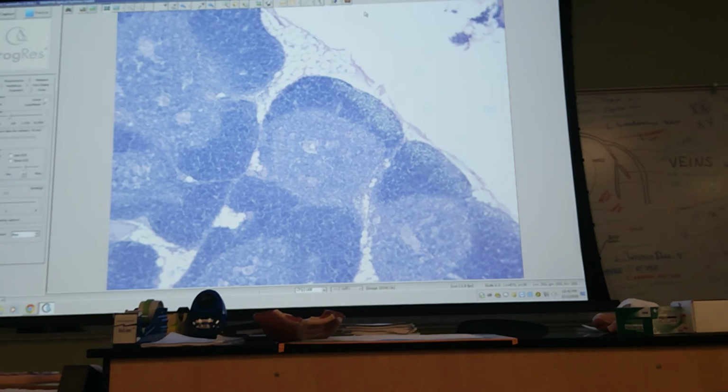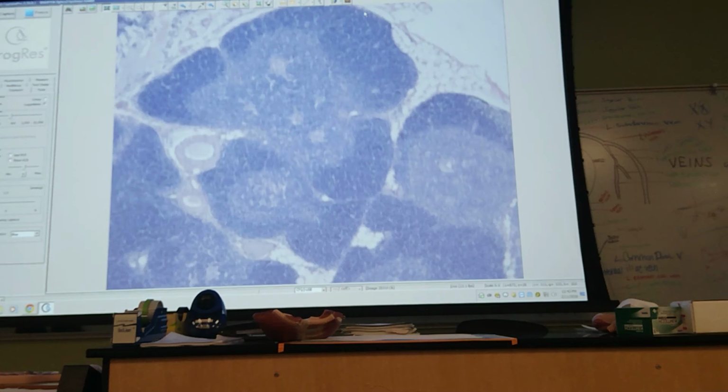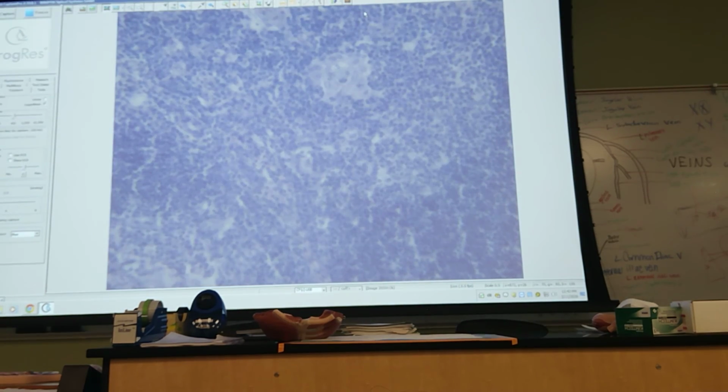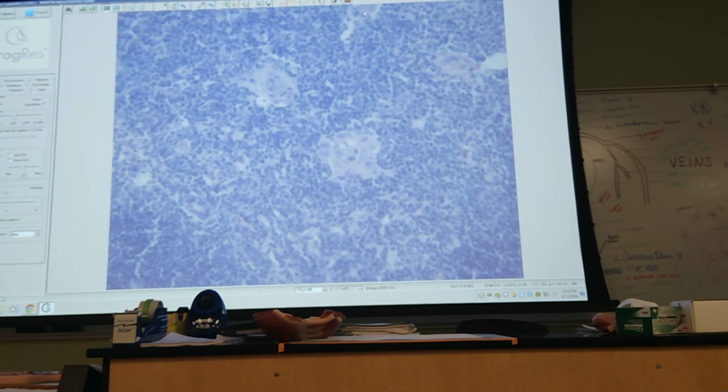Let's get another one. Thymic corpuscles.